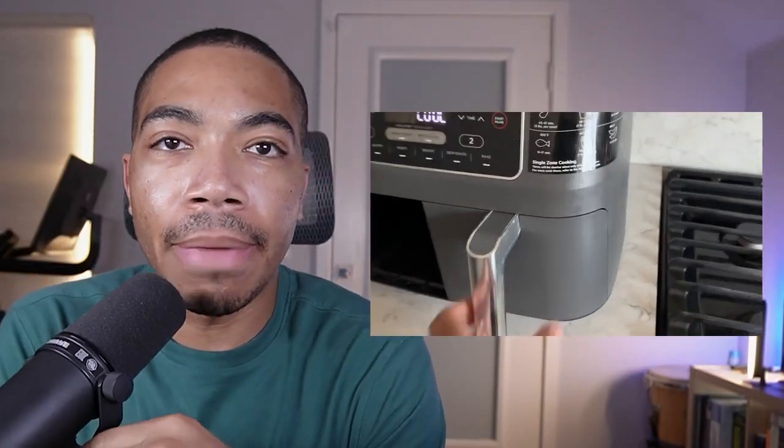I want to take this white bread and toast it. Now, interestingly, I had this idea and I don't have a toaster, so instead I actually used an air fryer. In fact, that's how we do most of our toasting and cooking, but I digress.